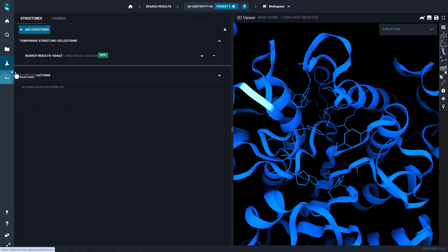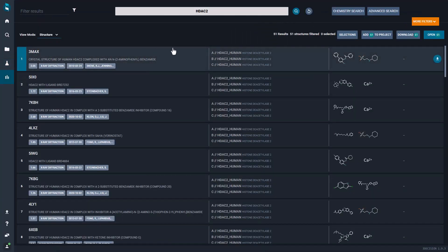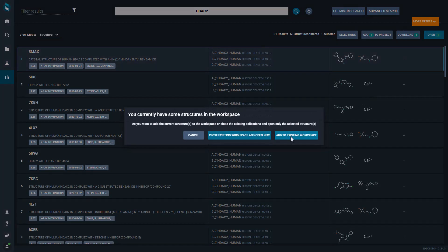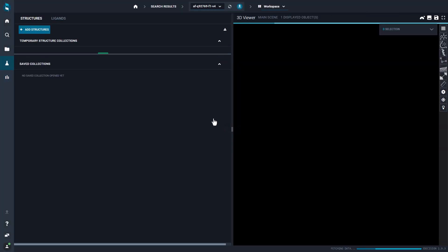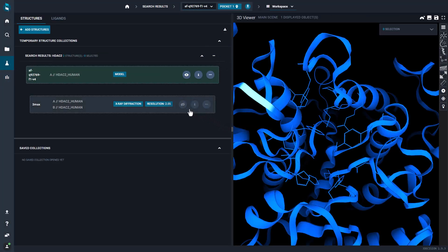Additionally, you can easily compare the AlphaFold models with experimental structures, just bringing them to the same workspace.